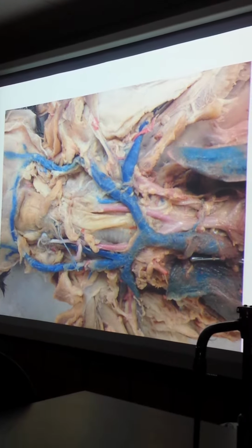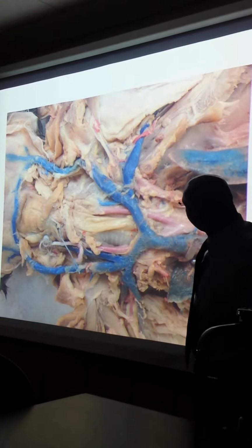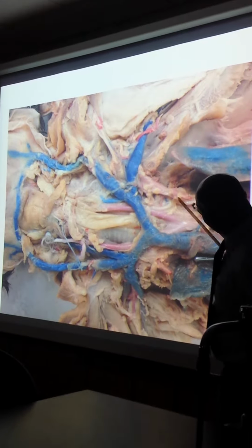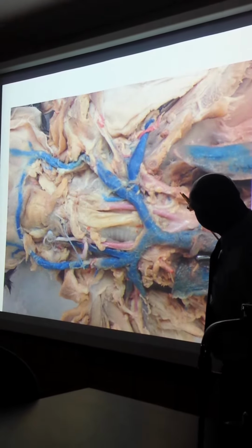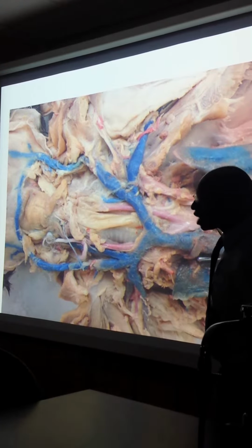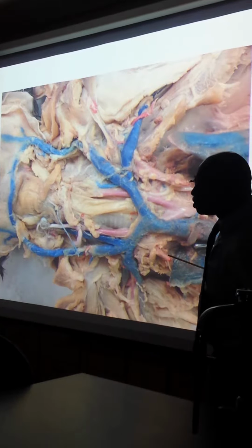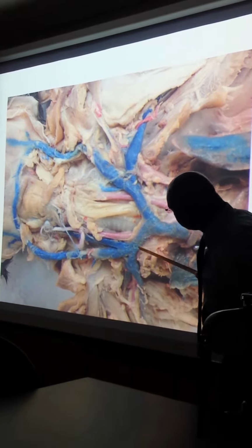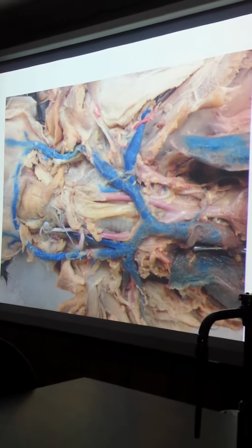And something heading up over here would be, you see the stumps of the internal mammary on this side. Do you see it right here? Do you see the cut? And also this on that cut, because it's a branch coming out of the subclavian arteries. Okay? The subclavian artery is kind of hidden here underneath this subclavian vein. Okay? And that's the first.